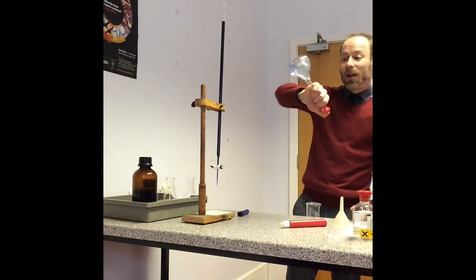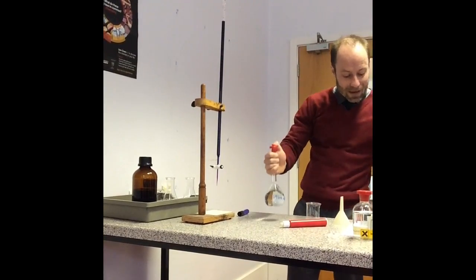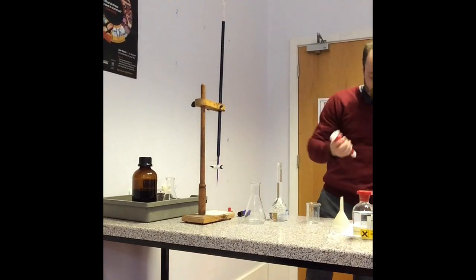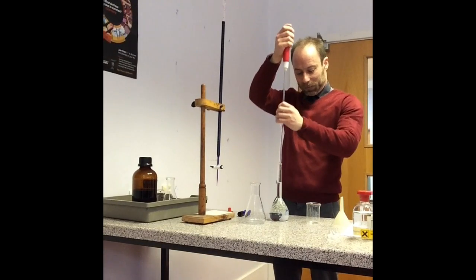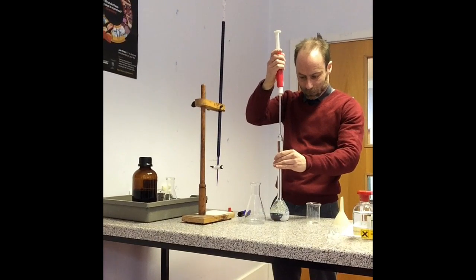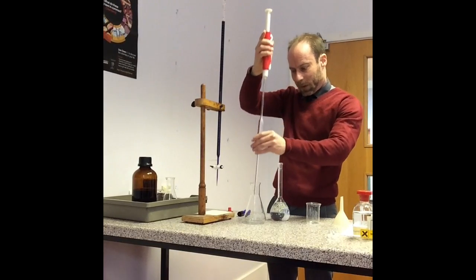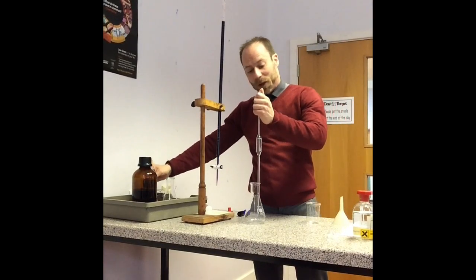Right, so I've got my solution B all nicely mixed up. So I now need to pipette 25 of my solution B into my conical flask. So I use a new pipette for this, because the other one's got solution A in it. Right, I'll set this up straight away. And in that goes into my conical flask. So I'm almost ready to do it.